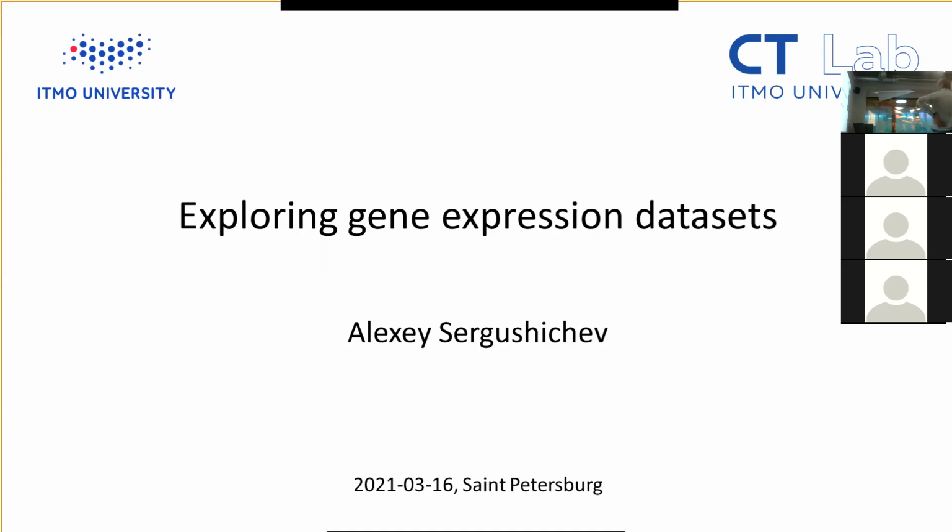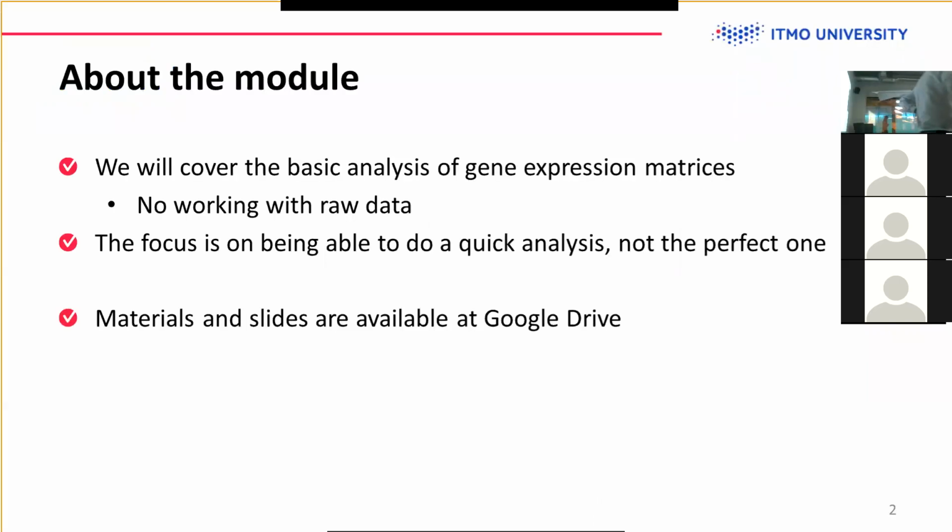So today's module, and actually tomorrow's, will be related to analysis of gene expression data. The goal of this part, for today and tomorrow, will be just basic analysis of gene expression data. So we don't go into much detail. We will go over that with Kostya next week.